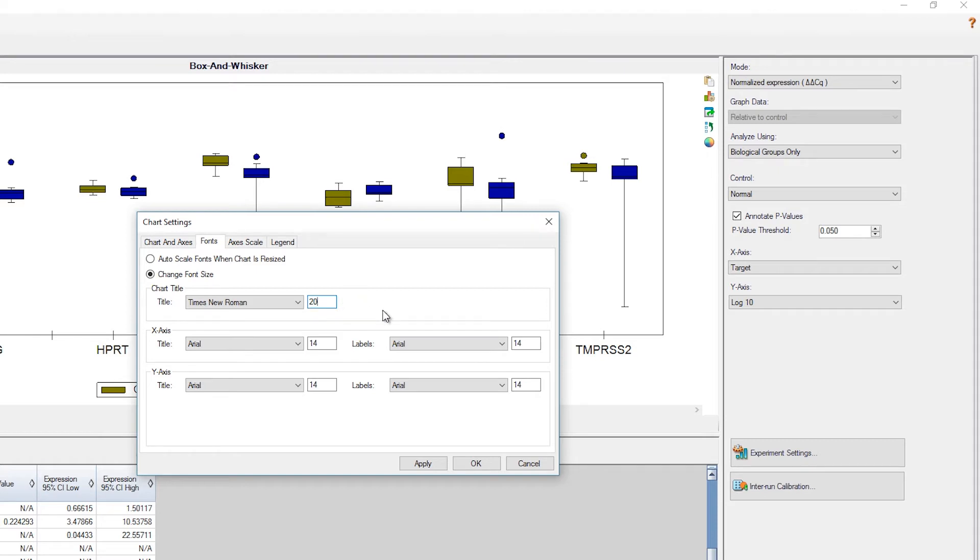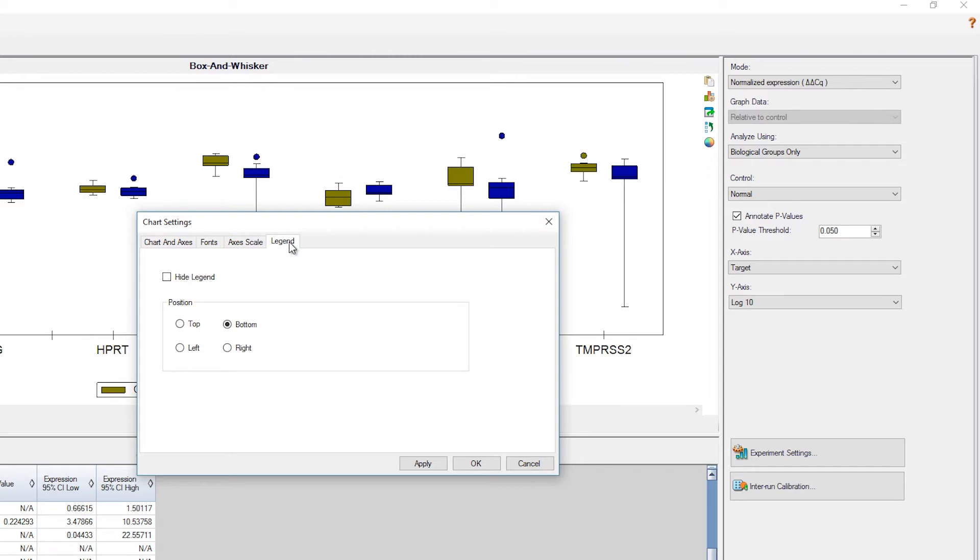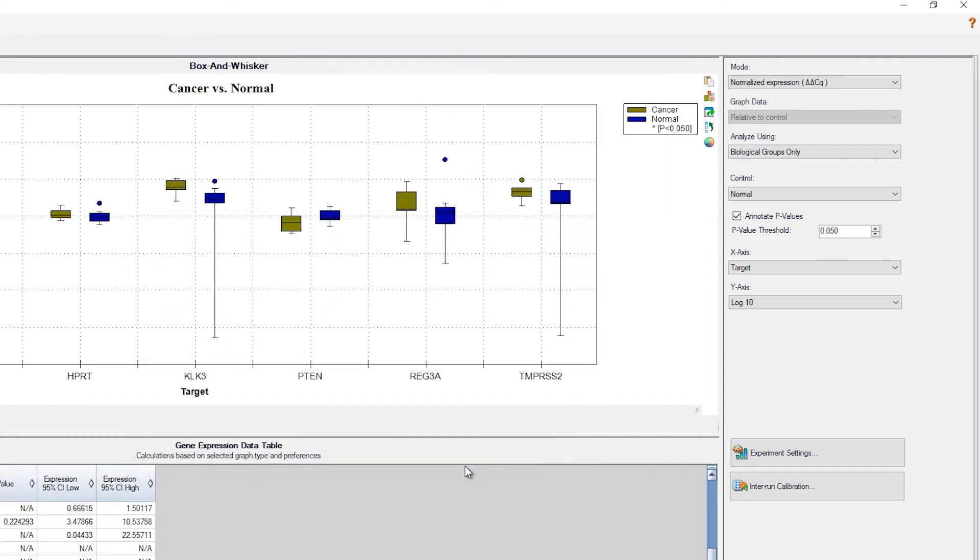Now let's add some grid lines to our graph. And under the legend tab, we'll move the legend to the right side of the graph. Okay, that looks good.